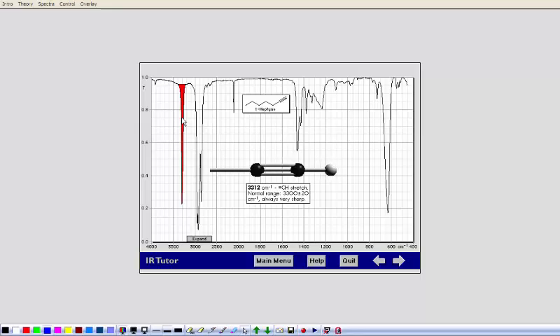If you just have a carbon-carbon triple bond, the carbon-carbon triple bond stretch you can see is very weak. It doesn't have a lot of intensity, and it's about 2,100 wave numbers. And then the rest of this stuff is just, what do they call that? It's like a wagging motion. Literally from the dog tail wagging. So we've got all these different motions for the triple bond.